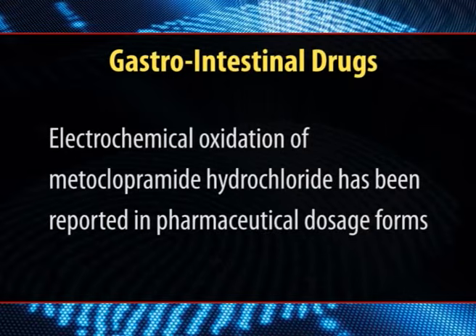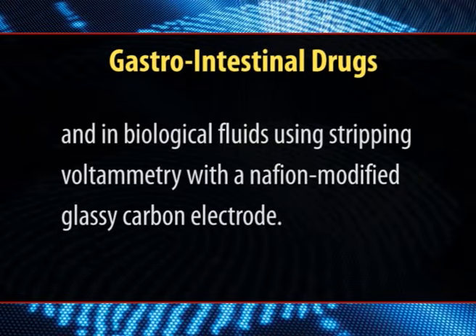A variety of pharmaceutical investigations are being analyzed by voltammetric techniques, and these include gastro-intestinal drugs, where electrochemical oxidation of metoclopramide hydrochloride has been reported in pharmaceutical dosage forms and in biological fluids using stripping voltammetry with a Nafion modified glassy carbon electrode.